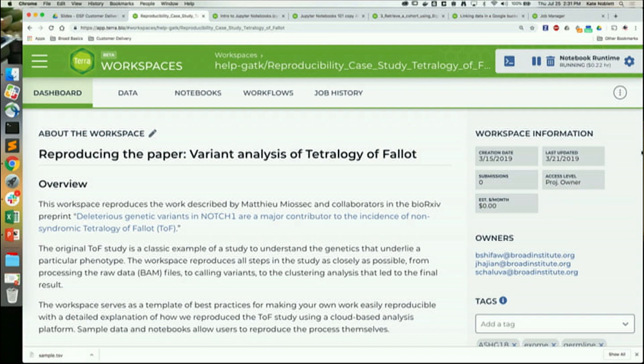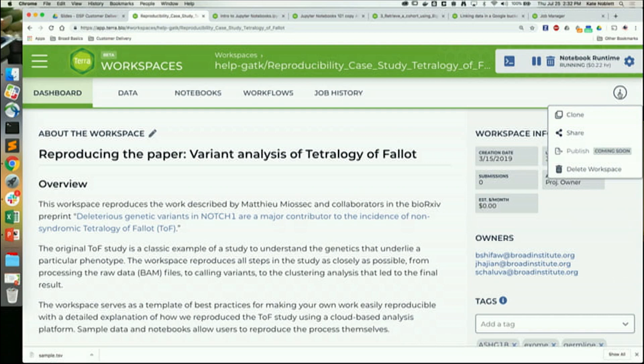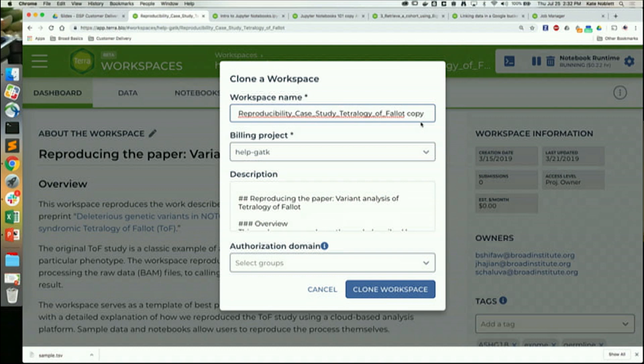Right now you should be inside of a public version of this workspace. Your access level should not be owner — you should only be able to read. If you want to clone your own copy, click on this button and click Clone, and then you will create your own copy.